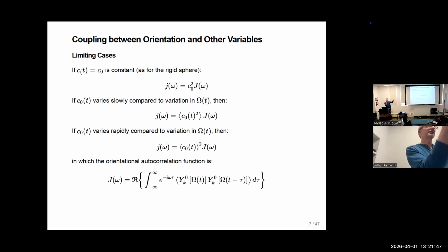If there's a remote hydrogen somewhere, the distance to each of the three methyls is going to be different, but the methyl group is rotating very fast. So you're going to see an average distance that looks like the 1 over r cubed squared distance. So, in principle, for example, in a structure calculation interpreting the NOEs to aromatic rings and methyl groups, those should be handled differently because of the difference in the averaging. Although I'm told by experts in structure calculation, it's not as important an effect as I think it is.